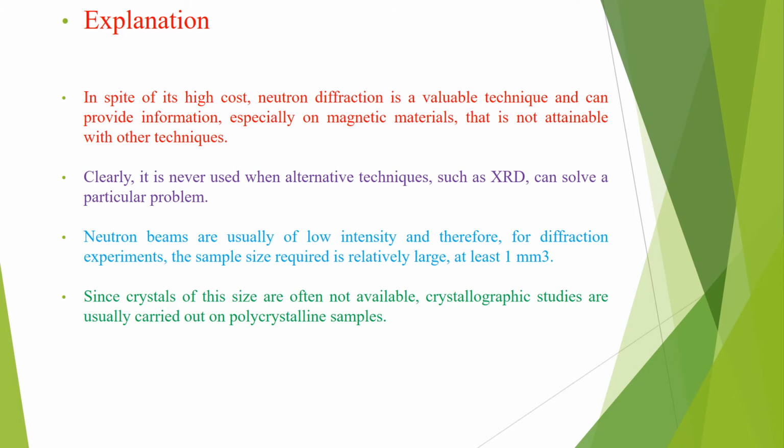Clearly, it is never used when alternative techniques such as XRD can solve a particular problem. So the neutron diffraction technique is only used when other techniques fail to solve that problem.